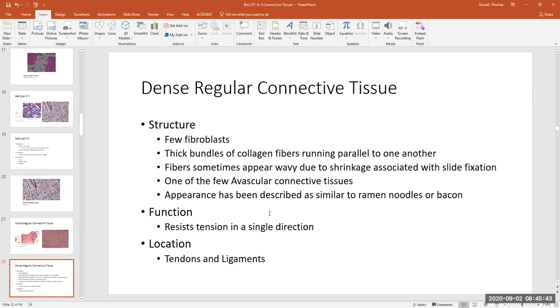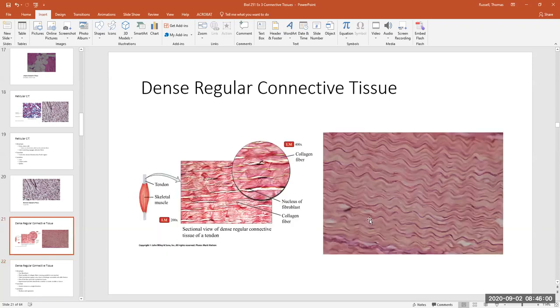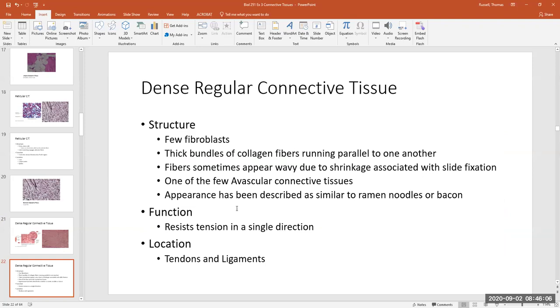There are a few fibroblasts in there that produce the fibers. Thick bundles of collagen fibers run at regular patterns with a wavy appearance, typically due to shrinkage during slide preparation. This particular tissue is one of only two types of connective tissues in the body that is avascular — there are no blood vessels running through it.